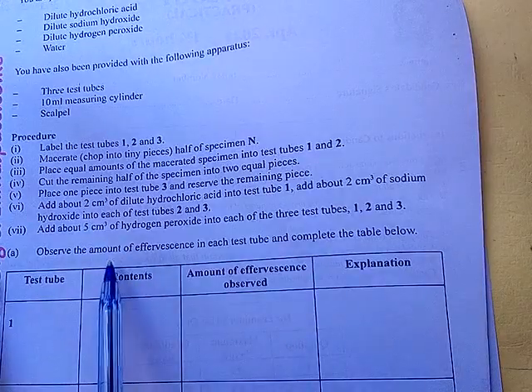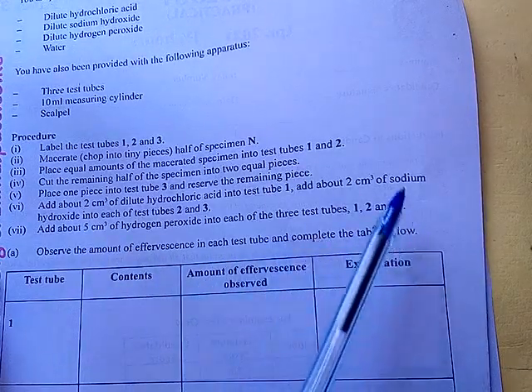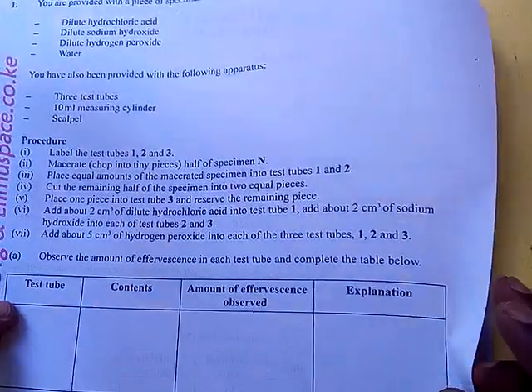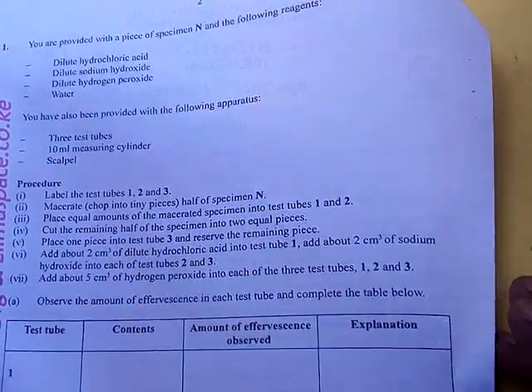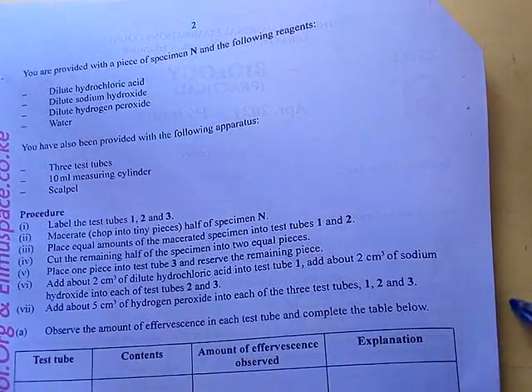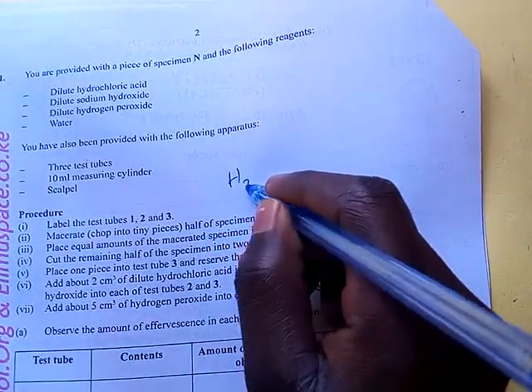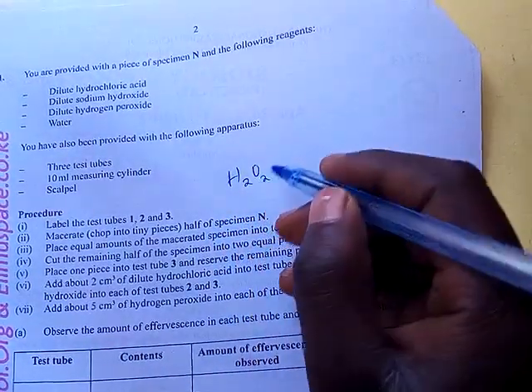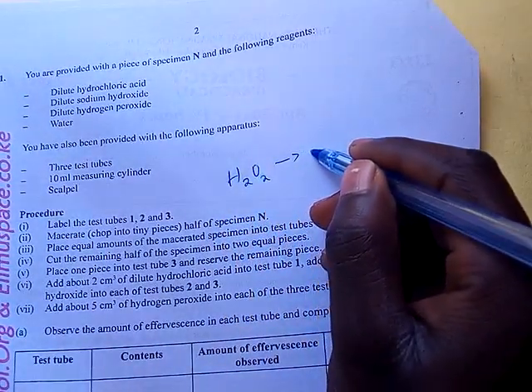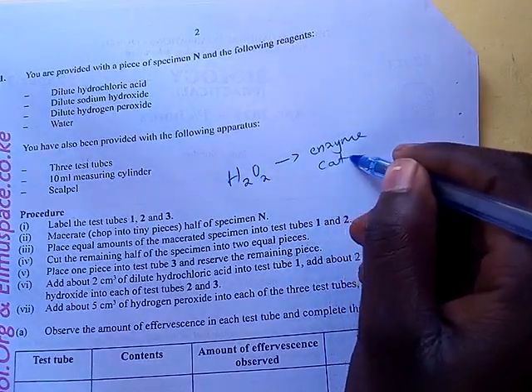Observe the amount of the effervescence in each test tube and complete the table. First of all, students should be able to know what is being tested. When you see hydrogen peroxide, you automatically know that you are testing for the enzyme catalase.